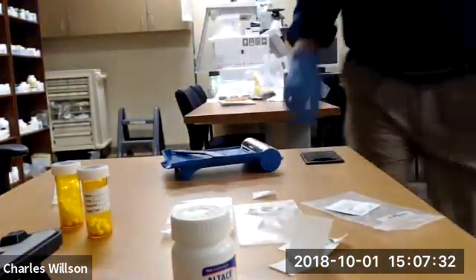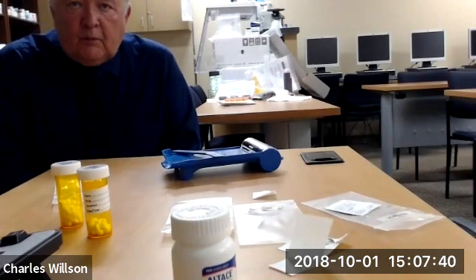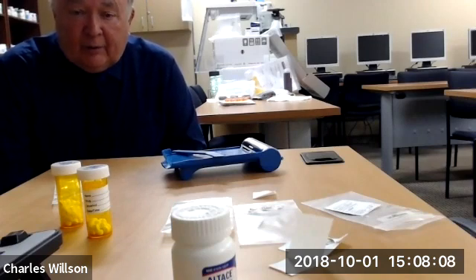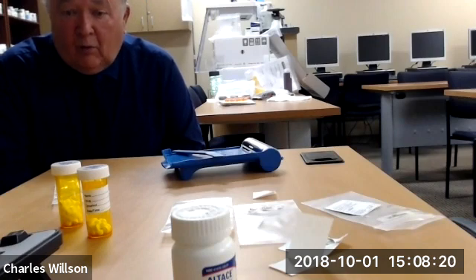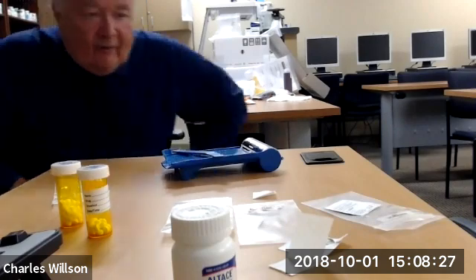Okay. Let me sit down for a minute and look at you. There you are. Okay. One of the things that is kind of like a principle is you don't have tablets around in anything that's not labeled. Okay, drugs must be labeled, period, so that there's no confusion about what's in there. What do we do with this? I'll tell you what you do with it. If you see tablets laying there and it's been there for more than a couple minutes and you didn't put them in there and you don't know who did put them in there, then you should throw them away because you've lost the identification of them. But anyway, that's what we have for now.